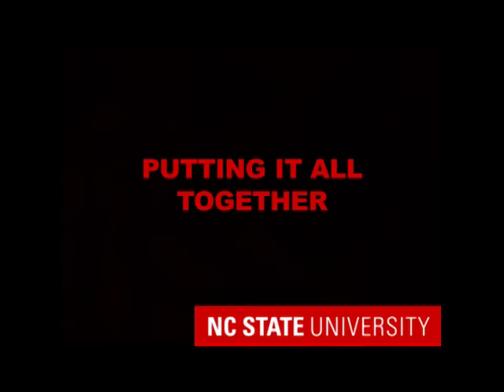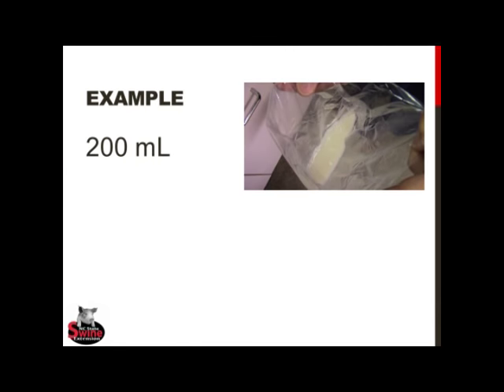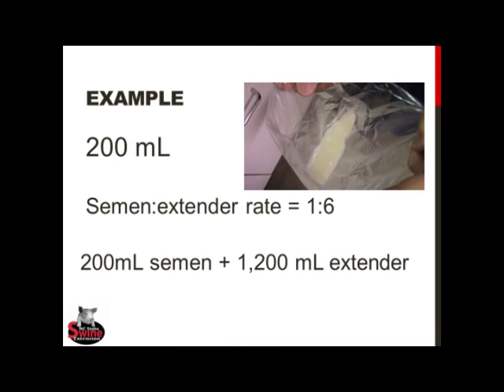Now let's run through a couple examples. Let's say our boar produced 200 milliliters of semen, and visual inspection tells us that the semen is good and free of blood and other contaminants, and the color and clarity most closely resembles whole milk. We'll use the 1 to 6 semen to extender diluting rate, meaning that we'll need to add 1200 milliliters of extender. Our extender should already be made up and heated to 99 degrees Fahrenheit.